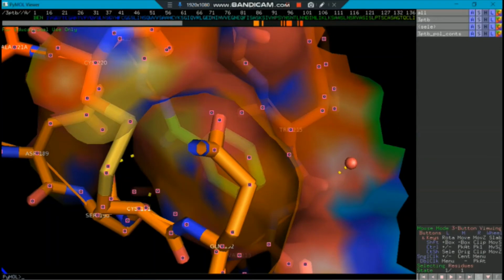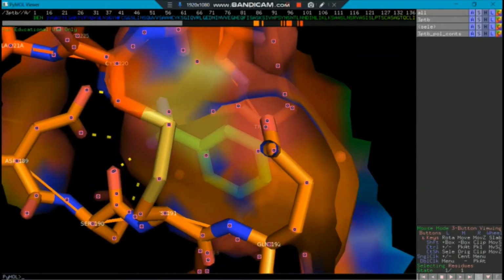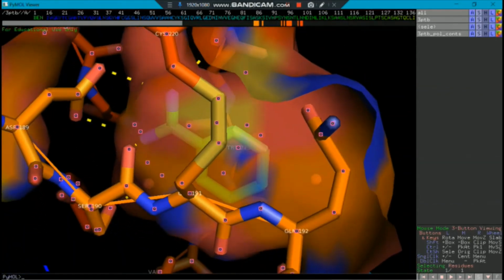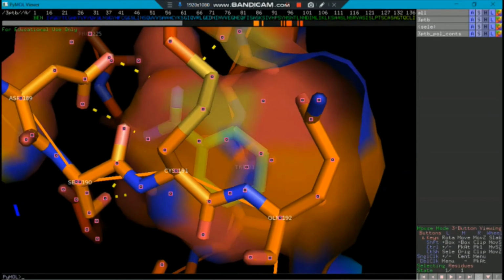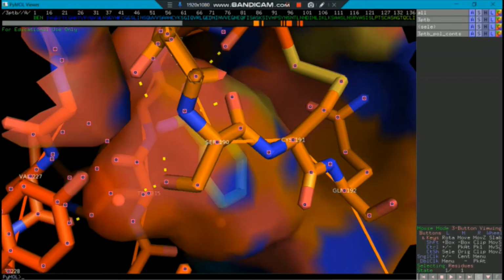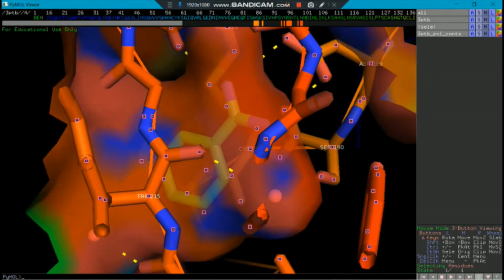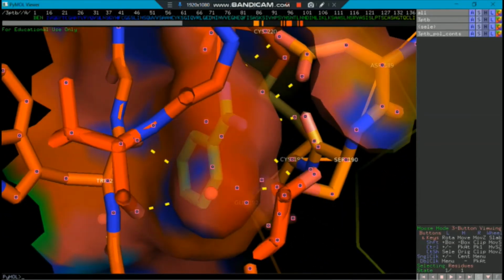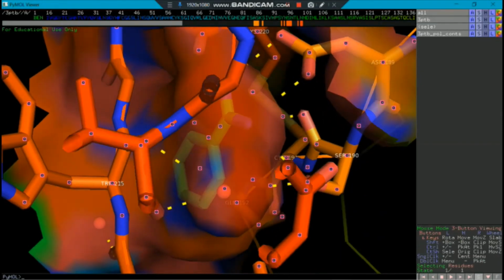So now we have named the residues here. The residues which we have here: I could see cysteine is there, serine is there, right? Alanine is there. Okay, and we also have the glutamine, right? So we have quite a lot of amino acids which are directly interacting. See, we have an aspartate group. The two groups in the aspartate amino acid are interacting with our ligand, and similarly is the case for tryptophan, the 215th amino acid. Similarly, serine is also interacting with our ligand.